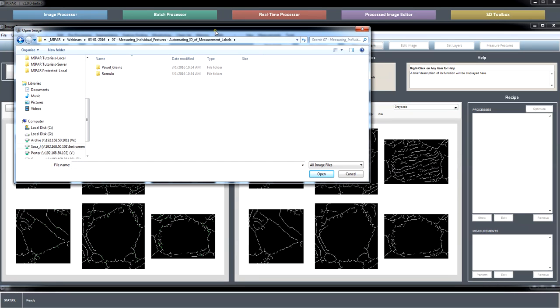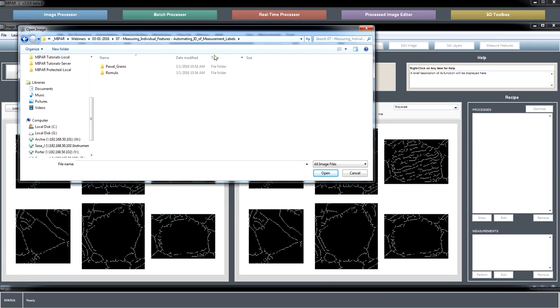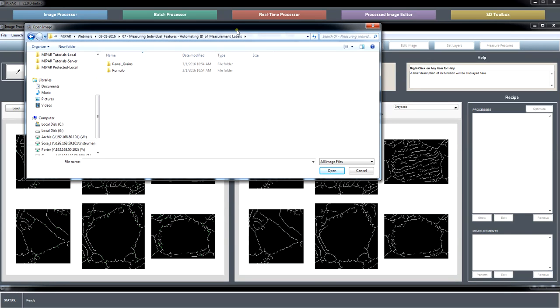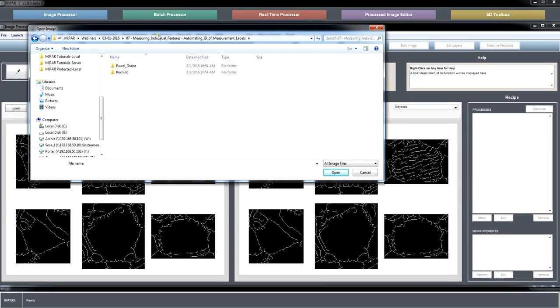3D wise, obviously the smaller the data set, the better. But we're able to work with, I would say, 200-300 slice stacks where every slice is 2K by 4K without too much issue. If you're looking at 500 slices of 4K apiece, it's going to struggle. So any cropping or resizing that you can do ahead of time without sacrificing necessary resolution is always advised.